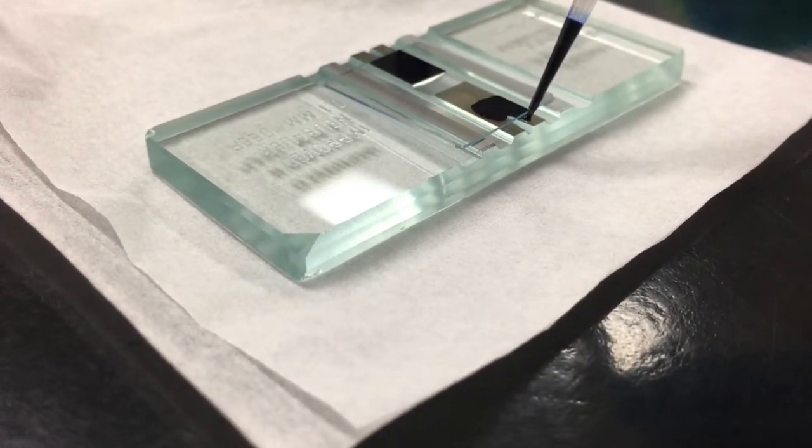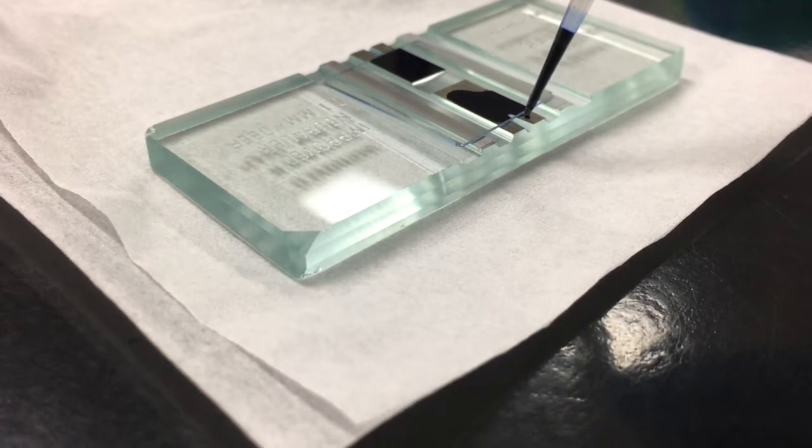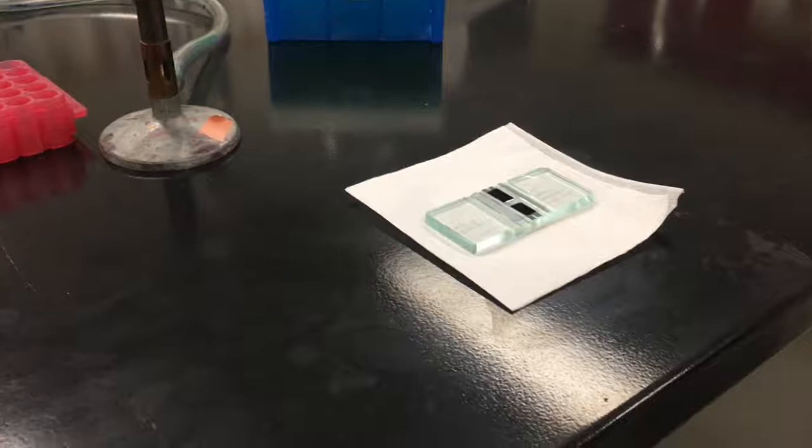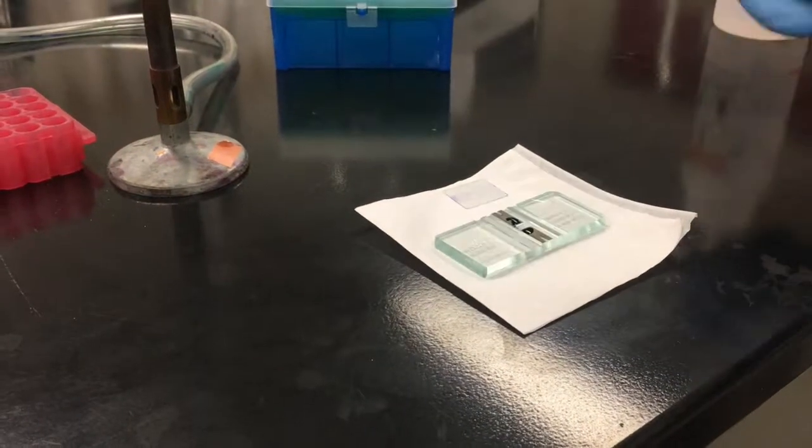Load both sides of the hemocytometer as you will be counting cells in both chambers. Your hemocytometer can be viewed under the 10x or 40x objectives of your microscope for counting.